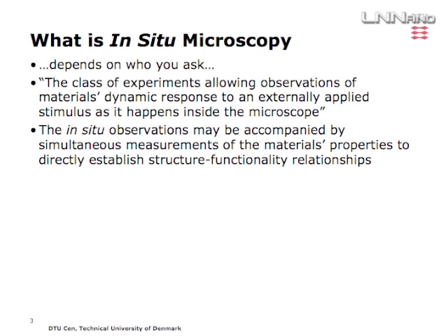And that could be via various routes. Furthermore, you can get feedback from the samples as they are exposed to various kinds of stimuli. This is again related mainly to catalysis studies. You can establish structure and functionality relationships of your materials when exposed to certain stimuli.